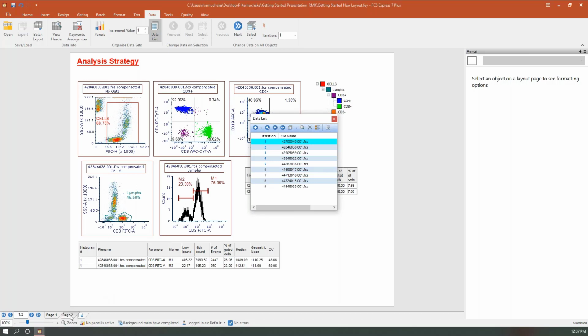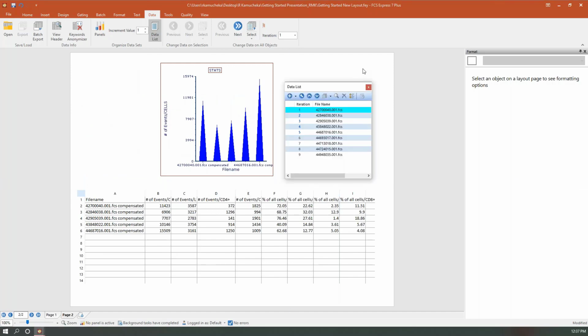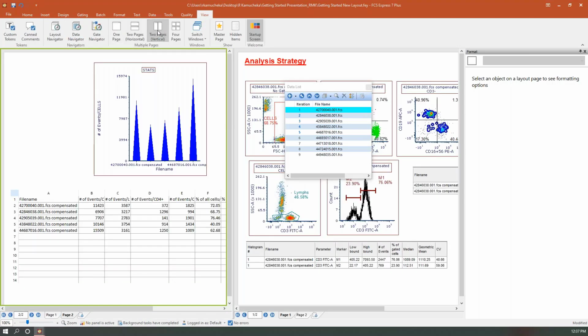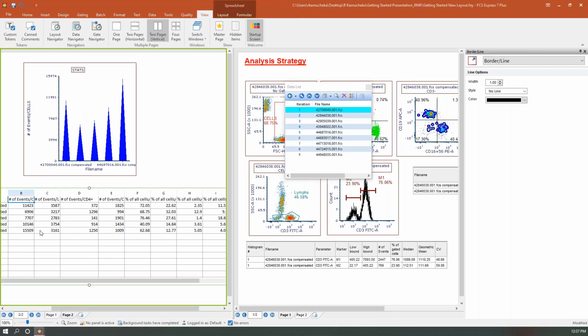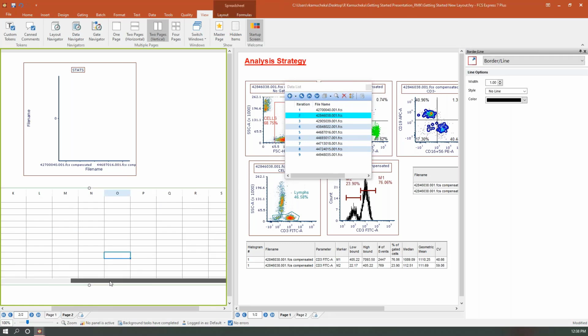What happened there is when I created that spreadsheet on the other page, I forgot to select that data source button again to make sure that it didn't batch between the next files. So there are 2 things that I can do here. I'm going to just fix it really quick because I think this is a great time to learn. This happens quite often, so addressing it on the spot will be pretty useful. So what I'm going to do is clear out the elements that I added with that second drag and drop. That's pretty excessive there, but we'll just delete that. Give it a moment to catch up with my speediness there.